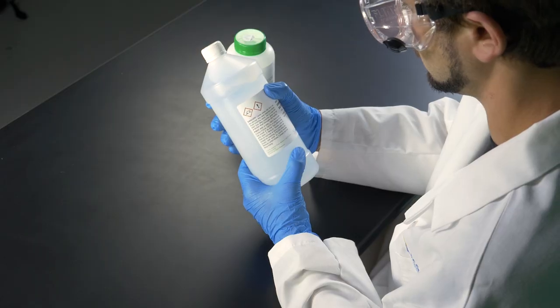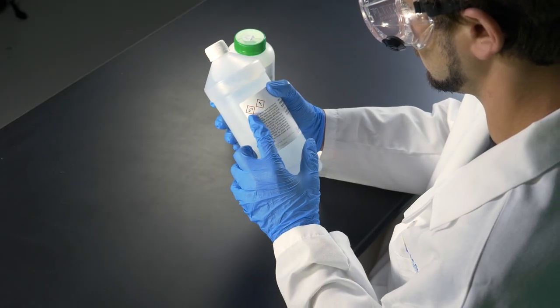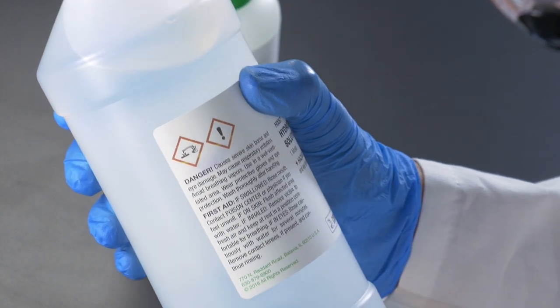The first step in carrying out a RAMP analysis is to identify and recognize all of the potential hazards. First, read labels on bottles and containers to identify chemical hazards. Hazards can be identified at a glance through the use of graphic symbols called pictograms. For more information about the chemicals you'll be using and their hazards, your teacher may ask you to review safety data sheets.